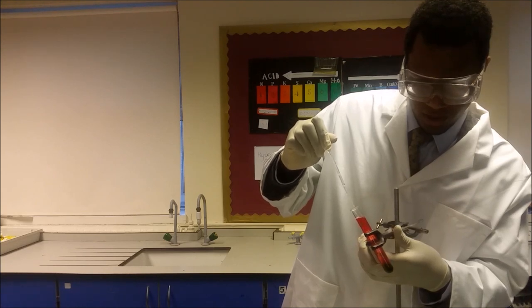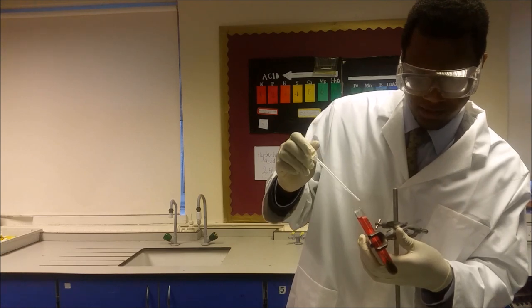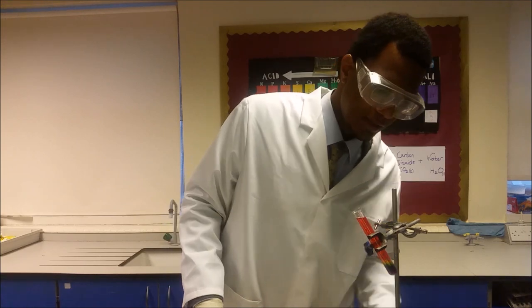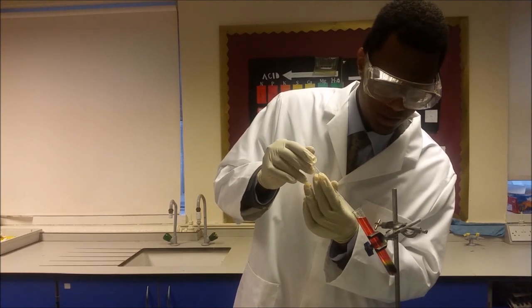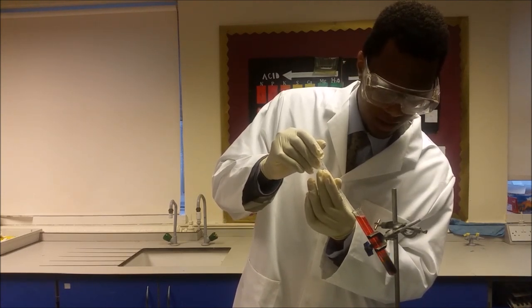What you'll notice is the sodium carbonate goes directly to the bottom and you'll immediately notice some fizzing as well. You'll notice a rainbow colour towards the bottom. If you want to move that rainbow colour slightly towards the top, just add some more of the sodium carbonate.